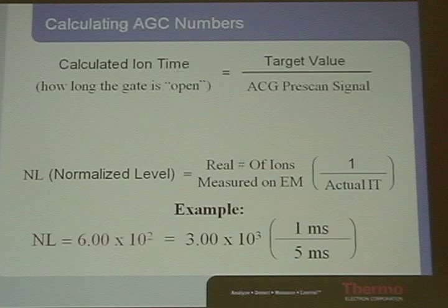Now, which do you prefer? You prefer short injection times. Why? Because then we have more signal. By having more signal, we can scan faster. So the more intense the ions are, the faster we scan, the more time we have to dig down into the grass.